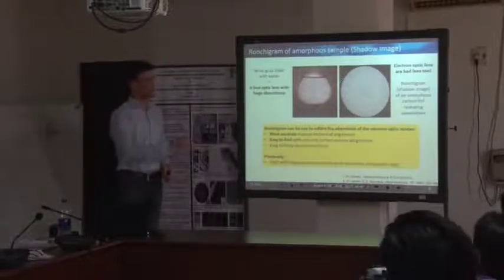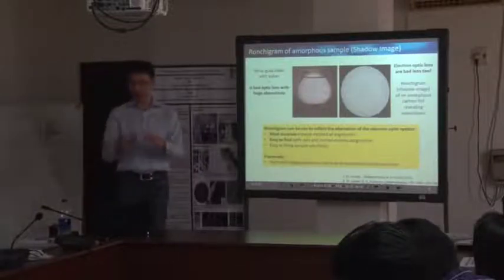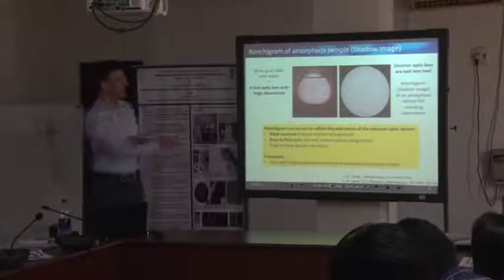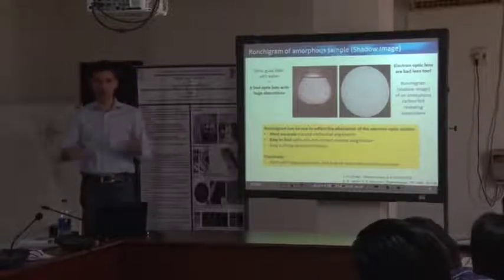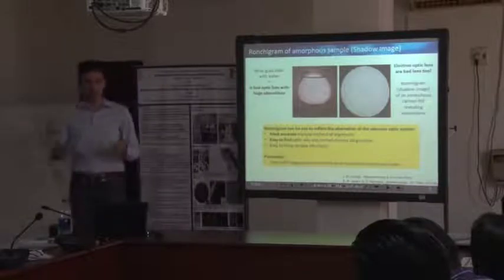One major aspect will be to select the right aperture and to center that around your probe, because we want to cut off the tail. What you see here, these outer areas, this is just the tail of the probe that we don't want to have, because we want to define our probe on the sample. And this is, in principle, it.